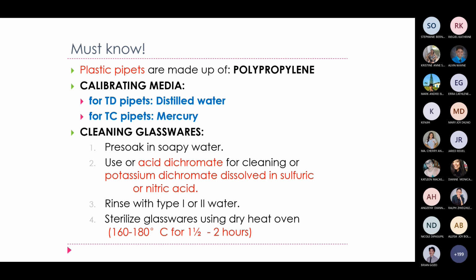For type 2 water naman, this is the water used for si CHIM. Sino si CHIM? For chemistry, hematology, immunology, and microbiology. Type 2, CHIM. And then sa type 3 naman, ito na yung panglinis, pang-washing, pang-rinsing, or yung mga panghugas ng tubes, ito na yung type 3 water.